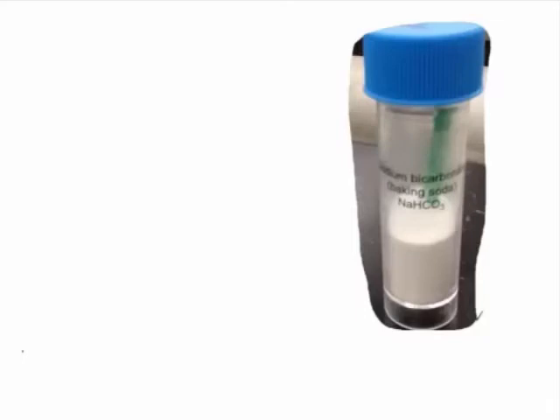You can see here that there are actually 3 different pieces of information that are provided about the substance inside of the vial. And so I want to break these down and explain which each parts of them are. First, you're going to see a word on the very top line, and that's going to typically be a longer word, and it might be a word that you're unfamiliar with.